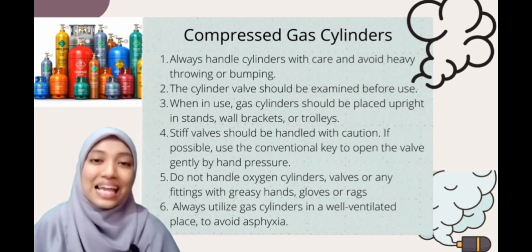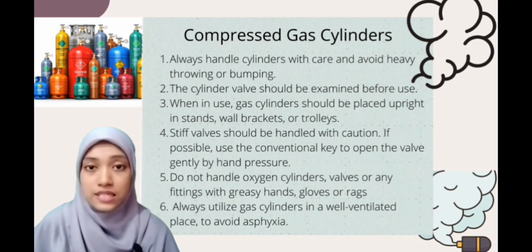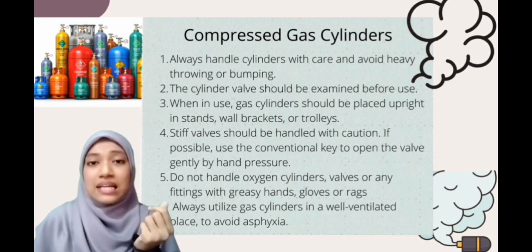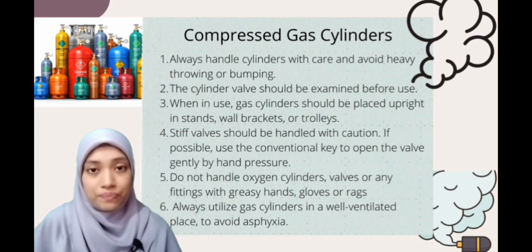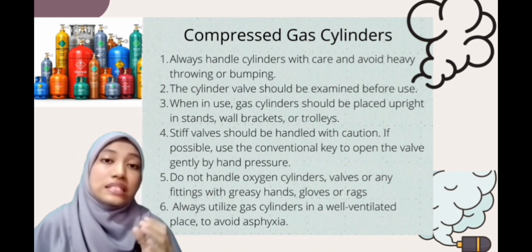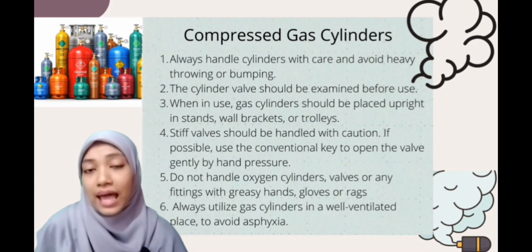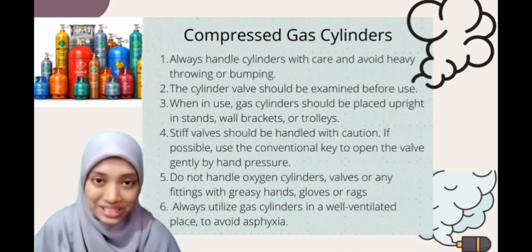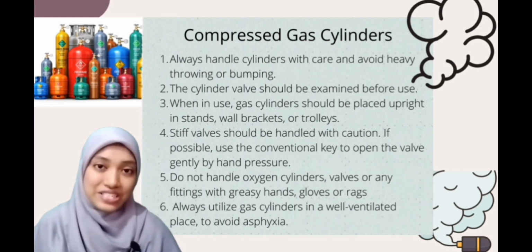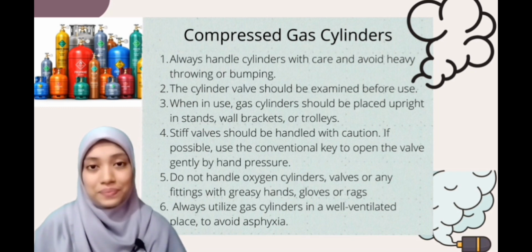The fifth step is do not handle oxygen cylinders, valves or any fittings with greasy hands, gloves or rags. But why? Okay, it is so that oxidation of the grease under pressure can be avoided and no explosion occurs. The last step is always utilize gas cylinders in a well-ventilated place to avoid asphyxia.